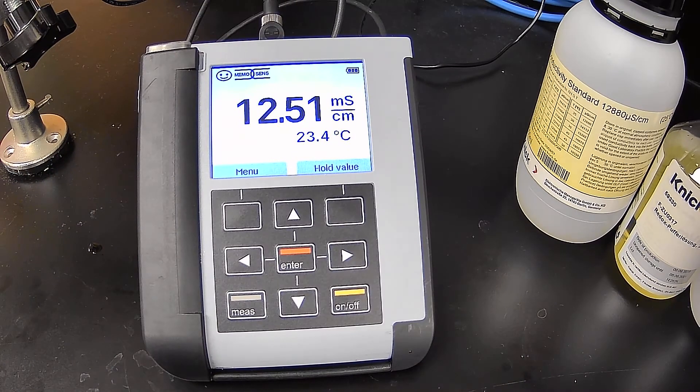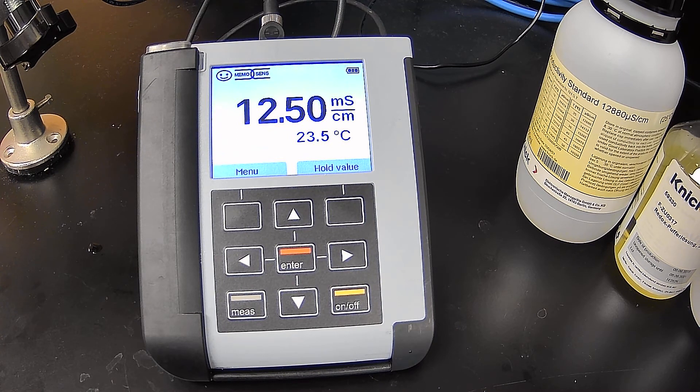Now, to calibrate a conductivity probe, it's pretty straightforward. Conductivity probes are basically fixed slope devices, if you will. Actually, what you're looking at is a cell constant, to be more specific. So what we're going to do is use the calibration solution to adjust the cell constant of this electrode.